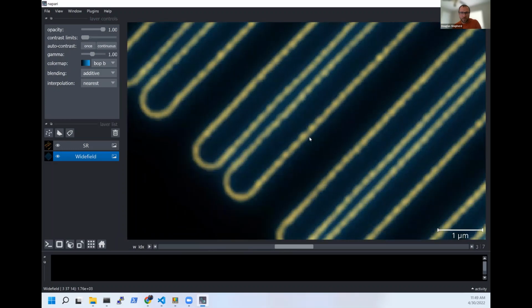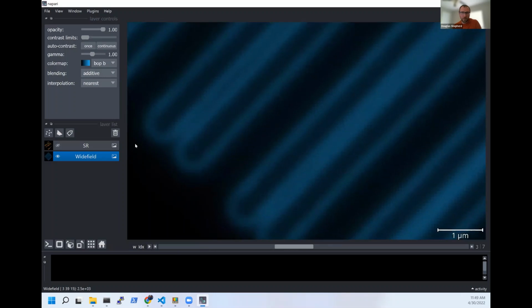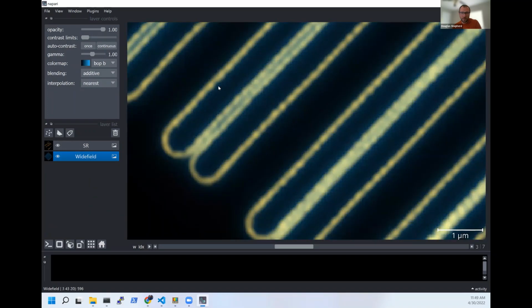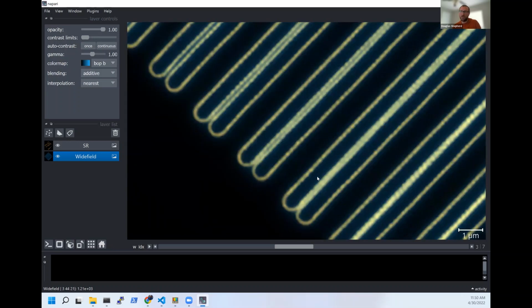And in fact, you can see as we go down and down, here I can't tell the lines apart in the wide field anymore, say after about this line, but I continue to see the line separation almost all the way down to this one. And so if we count the line spacings there, 390, 360, 330, 300, 270, 240, 230, 210, 180-ish. And I would say conservatively, maybe we could go to 150. We would have to take some line cuts and fit. And so this Wiener parameter really controls that.